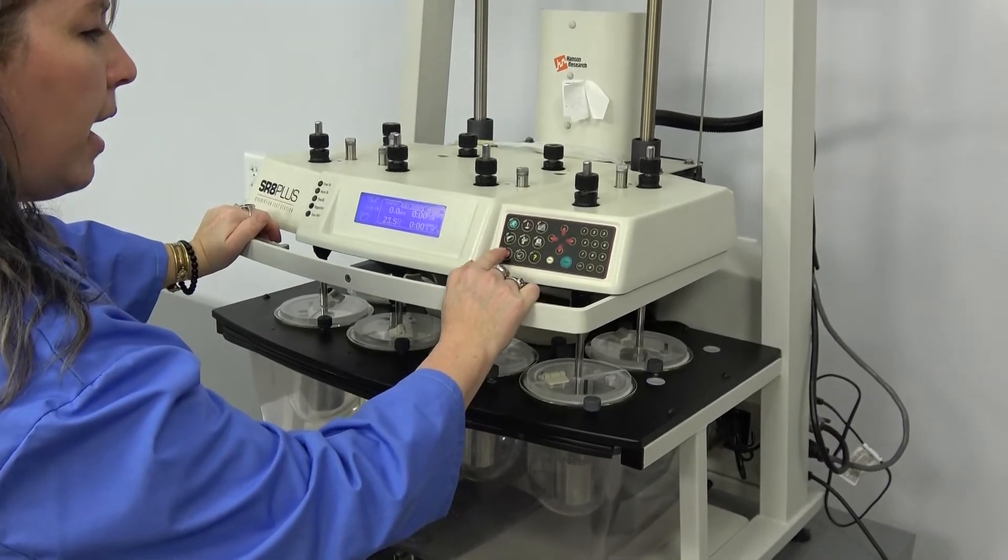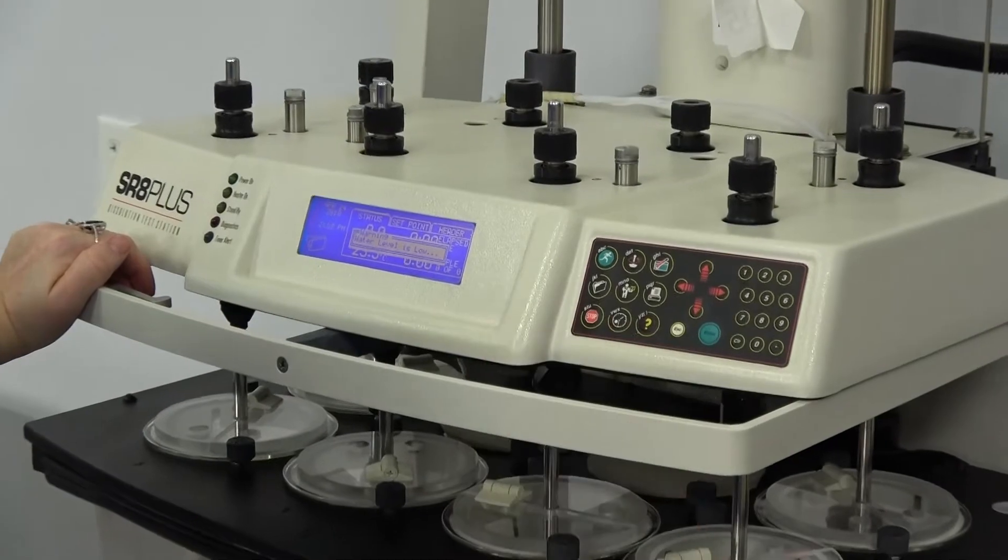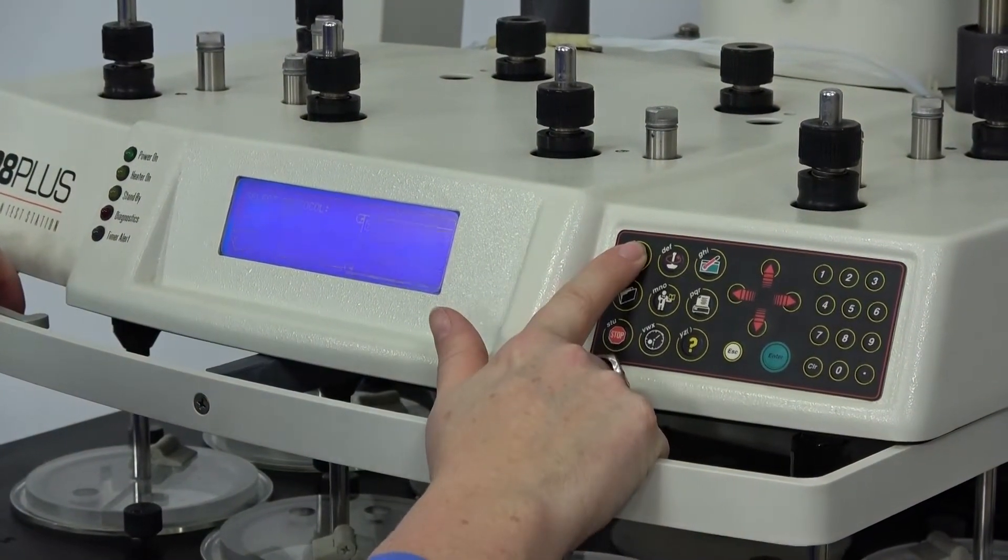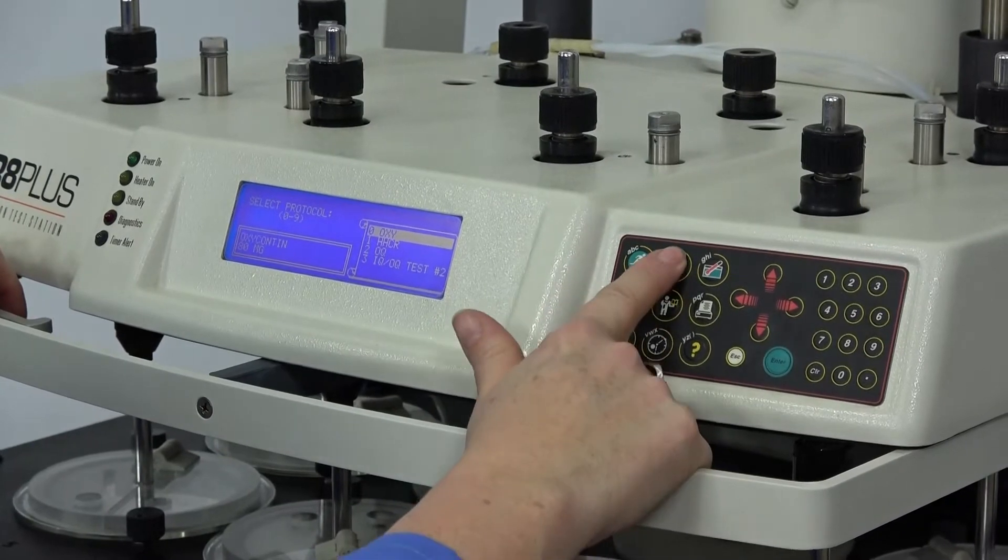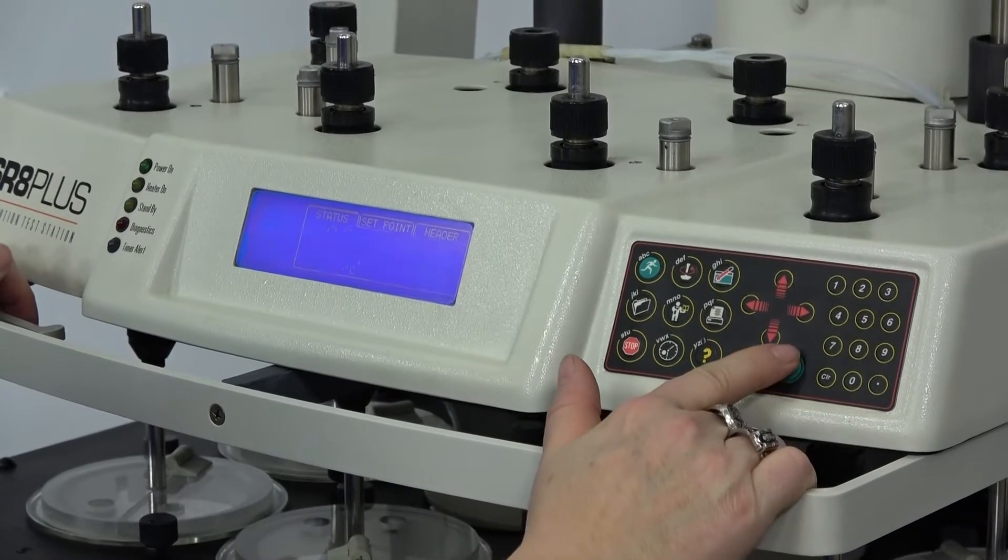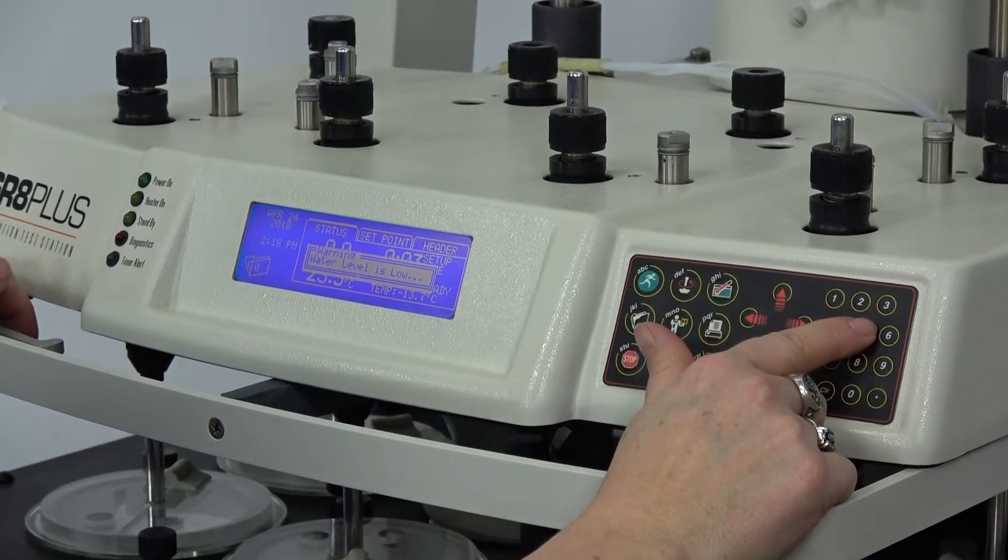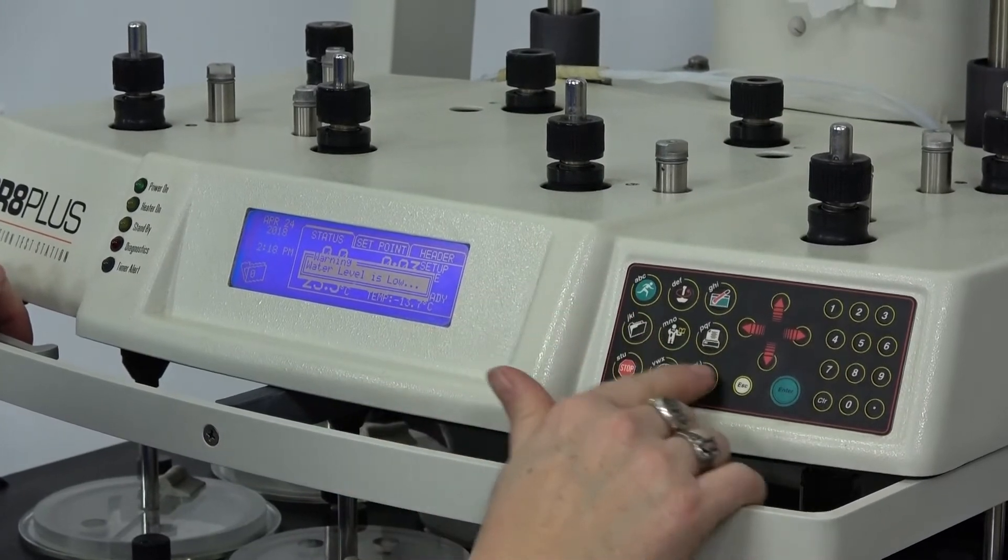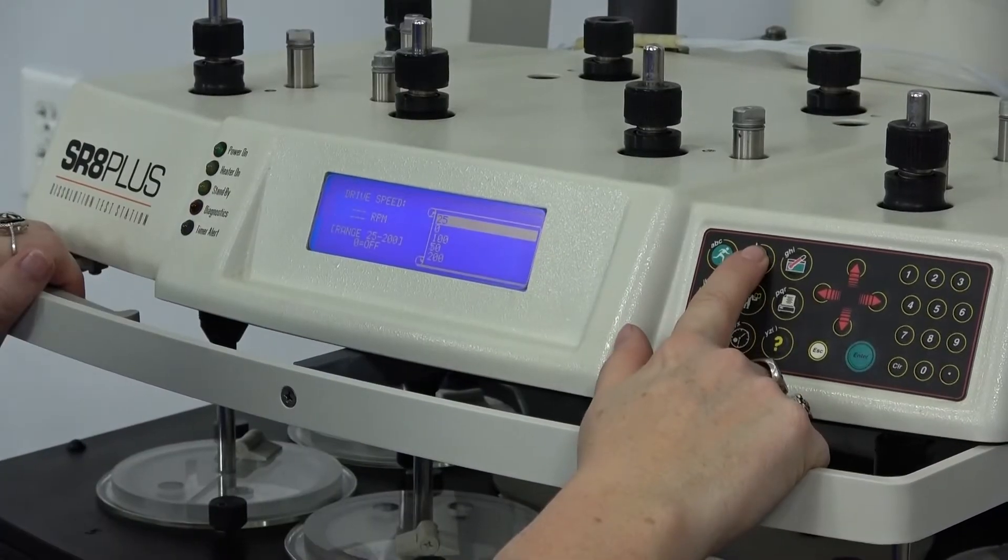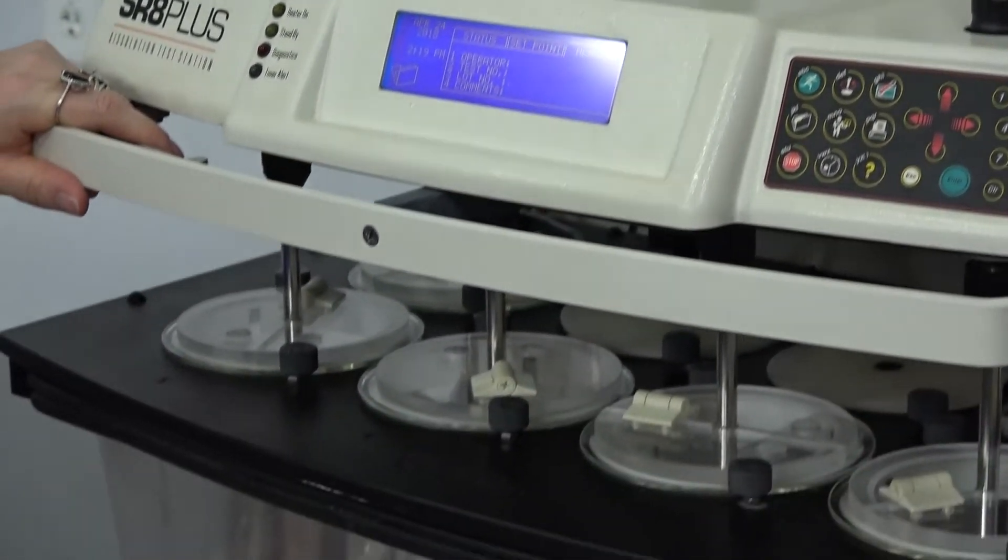We're going to go ahead and program it. It's telling me that the water level is low because we have no water in it right now. Our techs have tested all of these to make sure that it does heat. We're going to go ahead and start it on a nice easy cycle. There we go. So you'll see that all of these are turning.